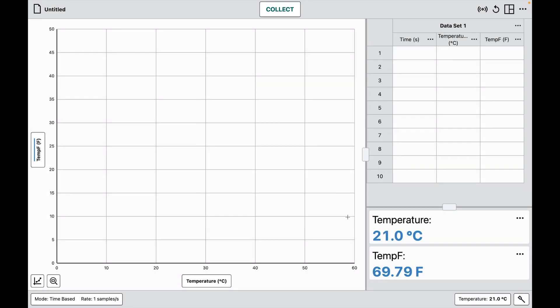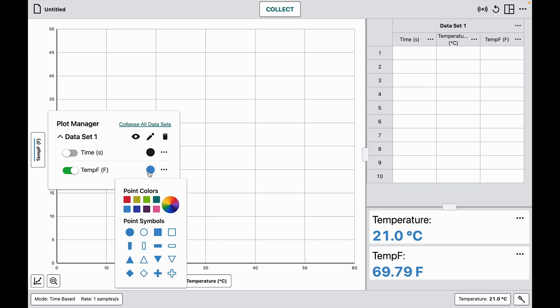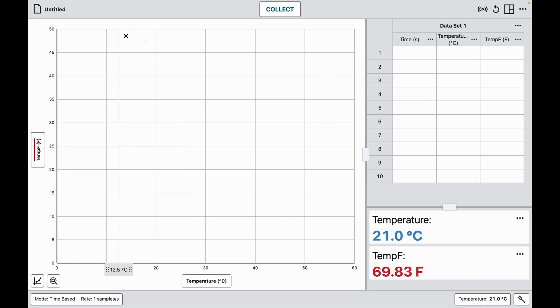Now I have both temperature in Celsius and in Fahrenheit displayed. I'll change this one to red so we can see it more clearly. Now I can collect my data.